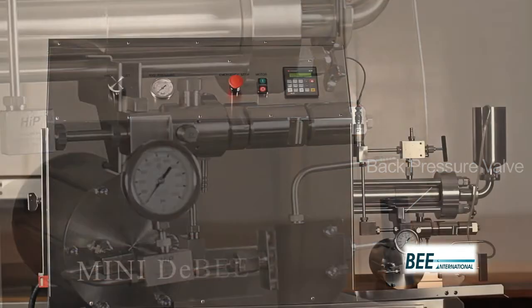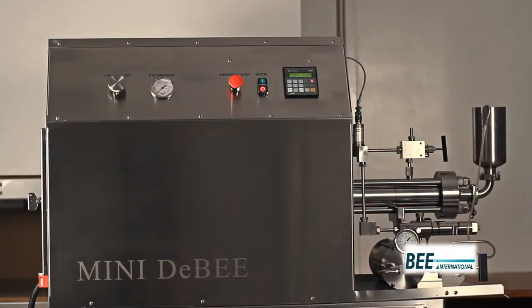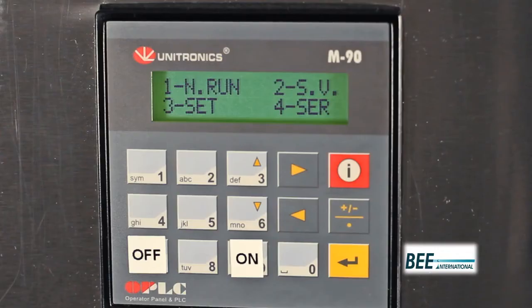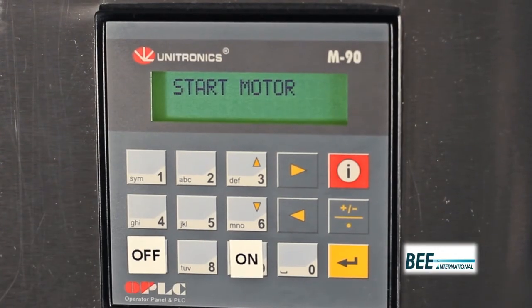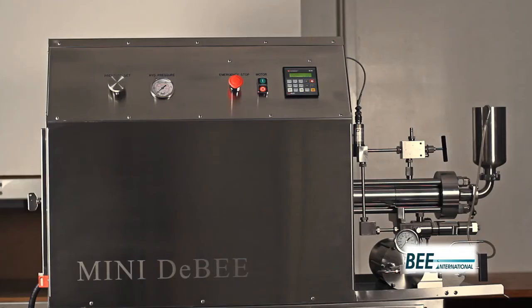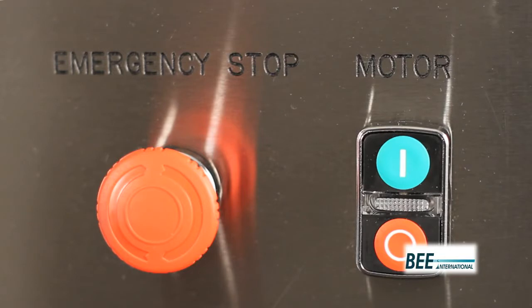To operate the Mini2B, first ensure the inlet reservoir is filled with product and the system is primed. Press 1 on the PLC to enable normal run mode. Turn the pressure set dial counterclockwise for the lowest pressure setting, then turn the motor button on.